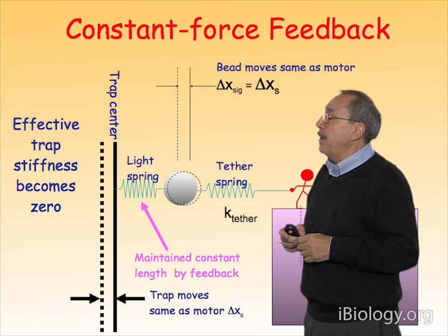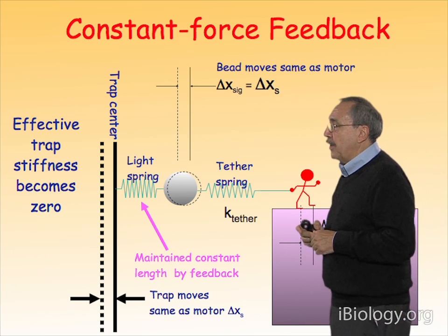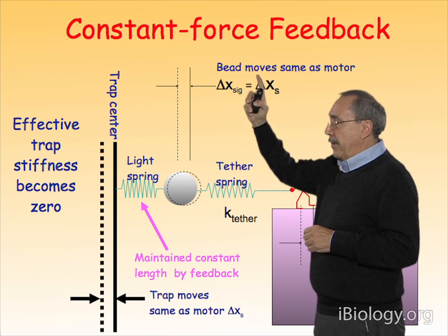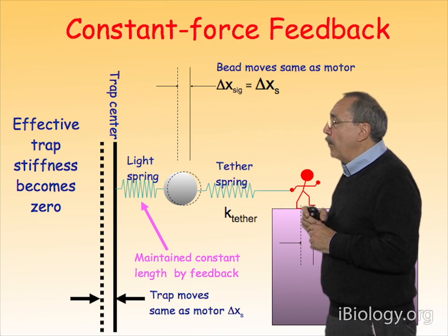Okay, there is another experiment that we can do for studying motors, which is the so-called constant force feedback experiment. What we do is this.